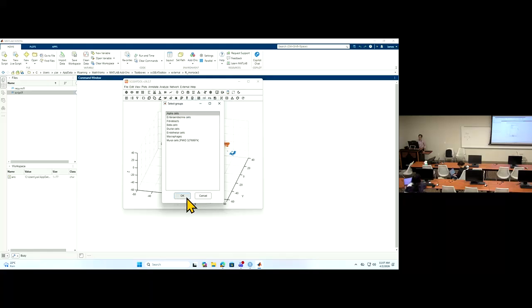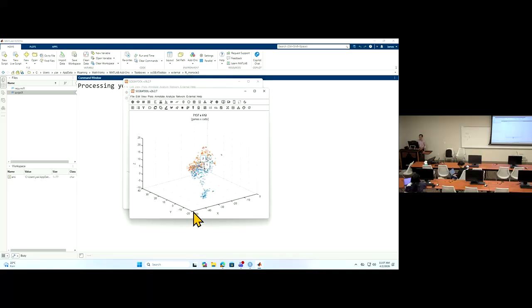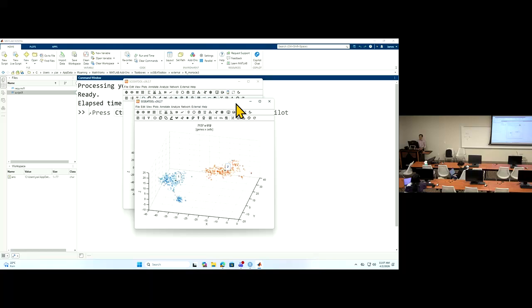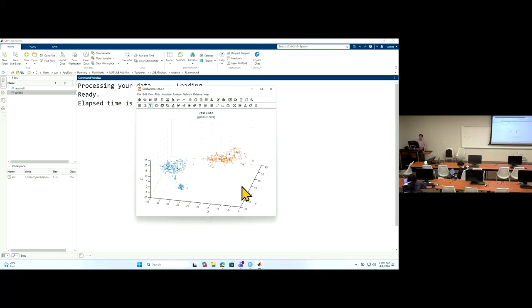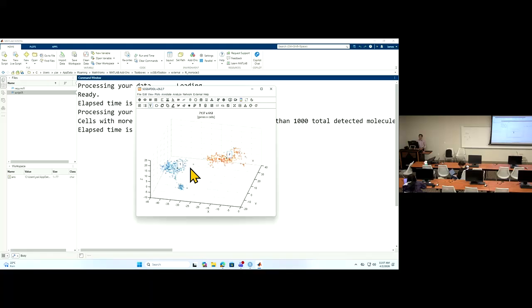That's good. So select them. I close the original, so we have this many cells. We need to do a QC, remove some genes with too low expression values. This changes our gene number, only removing 80 genes, so it's okay.